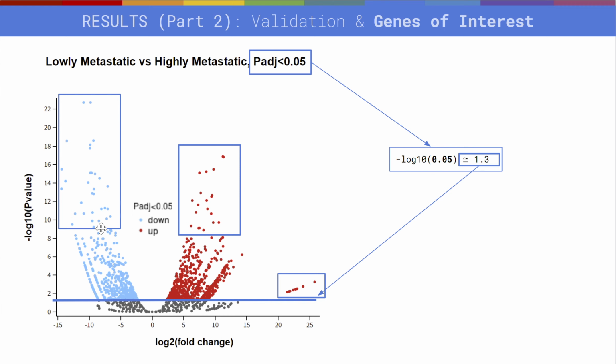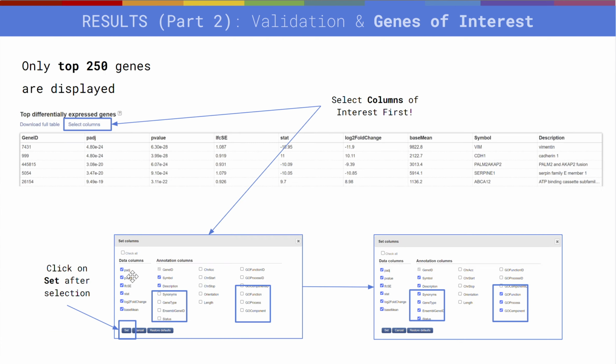So what are we doing here? Here we got the results, and right away I saw regions of interest. These genes are relatively more spread in terms of significance, because they're very high on the Y value. And these ones, for example, are very upregulated on the extreme. These are still a lot of genes to look at, but even those below them are of significance. So there's a lot even to look at.